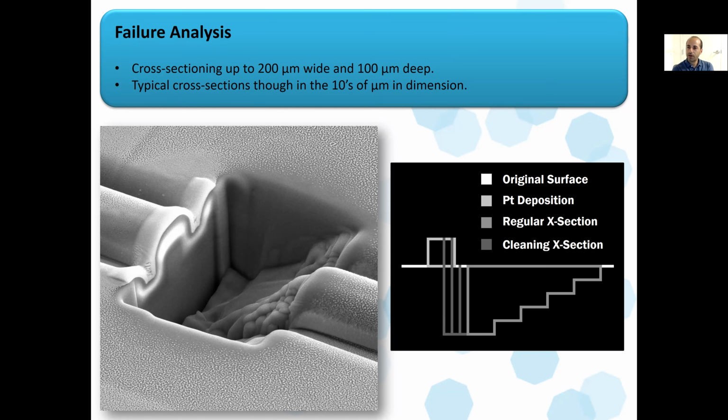Are those depositions done by the column or the sputtering before? So the blanket gold deposition over here is just done with a basic desktop sputter system. The platinum, which is deposited here, is actually done with the focused ion beam system. Just like I can tell the ion beam to cut only in this area to produce this hole, I can tell the ion beam to only scan in this area. And while that's occurring, I will stream an organometallic gas into the system that has some platinum attached to it, and it will decompose onto the surface just where I tell the beam to scan.